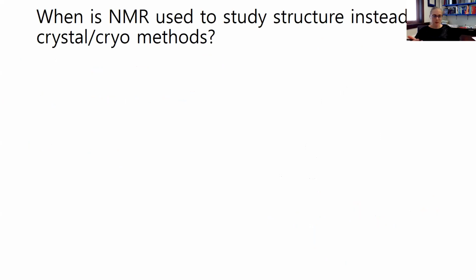But I want to move over to talking a little bit more about biophysics, since this is a biophysics course. And for those of you that use NMR, or also in our discussion how you can use this in solids or for liquid samples as well, what ideas do you have of why NMR would be used for structure, instead of the methods we were talking about last week, like cryo-electron microscopy or X-ray crystallography, or even some of the fluorescent methods? Any ideas or thoughts?